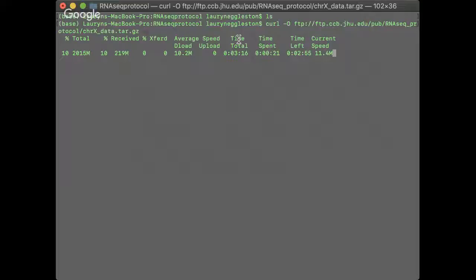This might take a second, but it definitely won't take as long as it was taking at home. When I did this protocol the first time, I was practicing it on my desktop, and it went a lot faster than trying to use a wireless connection, but fingers crossed that it will just work with this.